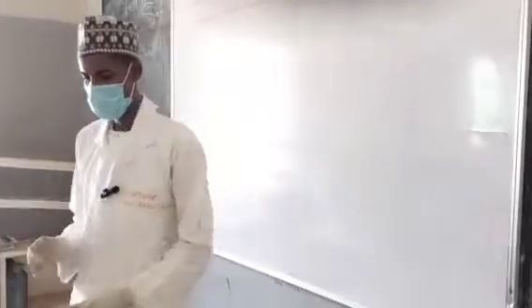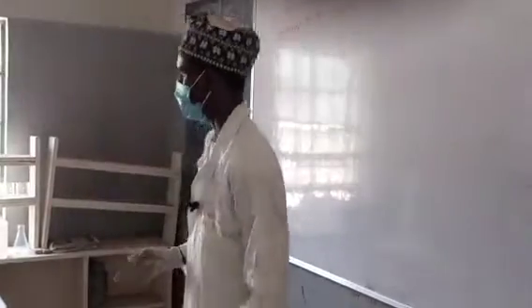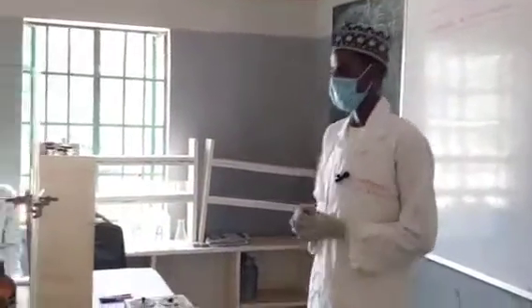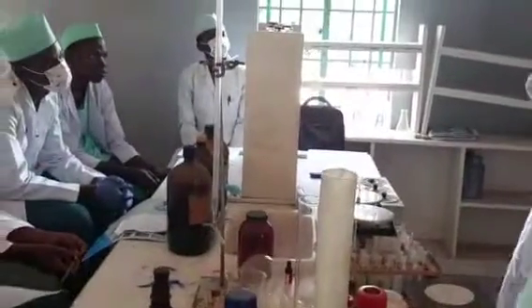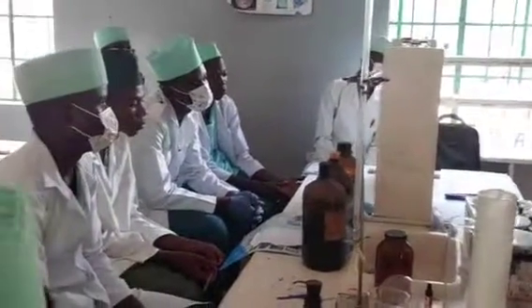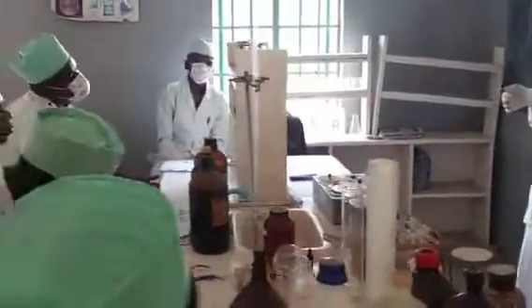There is a question you ask. Yes. Why did you store this chemical in this amber bottle? Yes, as I have said earlier, chemicals are stored in amber bottles to deprive light from coming in. Why? Because we have what we call photolytic compounds.